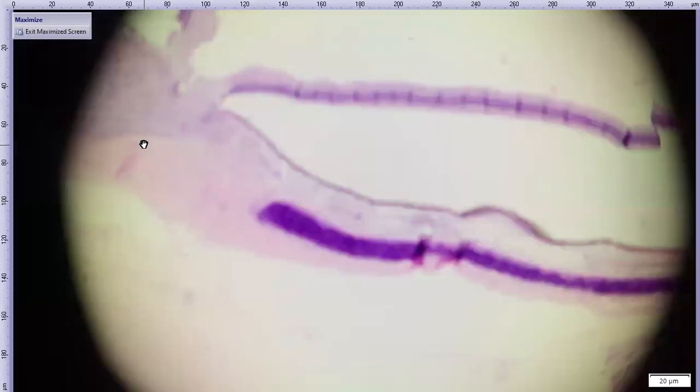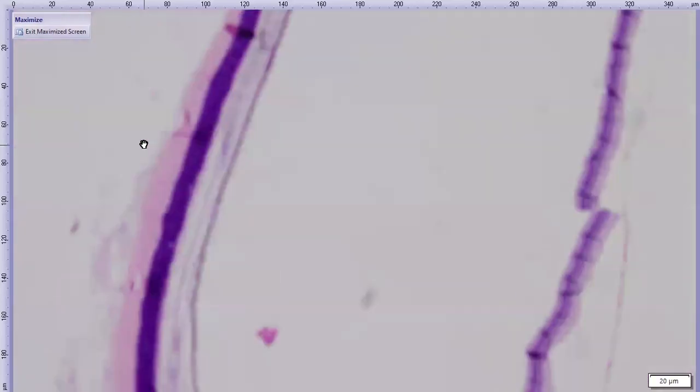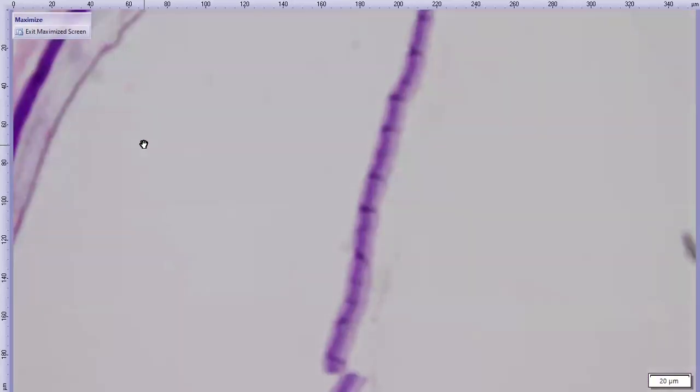Let's go back to the eye. So we do have several echidna eyes. This one has no area where the retina is attached. I'm pretty sure we've addressed that. Okay. So cartilage, oil droplets. Oh no, the echidna doesn't have oil droplets, but the platypus has oil droplets, double cones. I can't remember what the other one is.